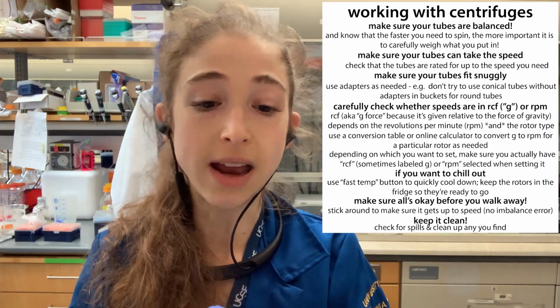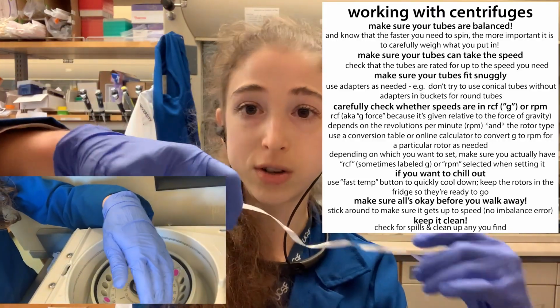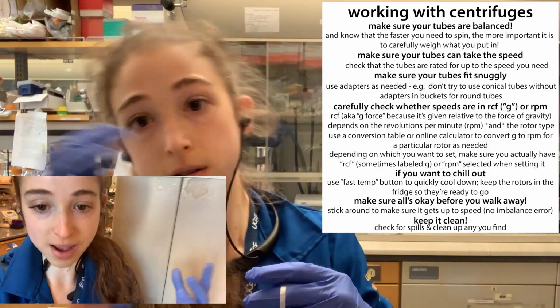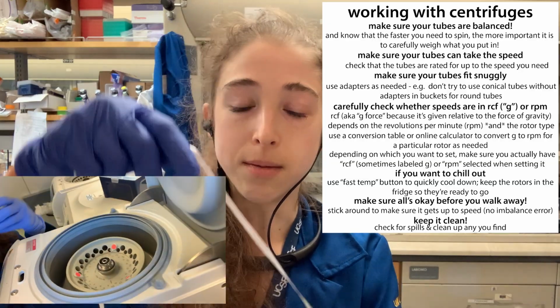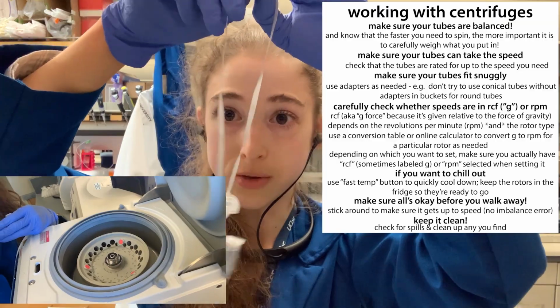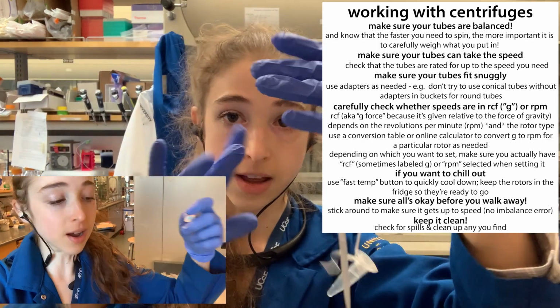When you're using any of these centrifuges, you need to make sure that you're balanced. When you have force being applied, if there's no other force being applied opposite, then it's going to go, which you don't want. So the centrifuge is smart, and it's going to tell you there's an imbalance typically before that happens. But to make things balanced, you need to have an equal thing opposite of it. And so if you have an equal number of tubes, they're going to be across from one another.